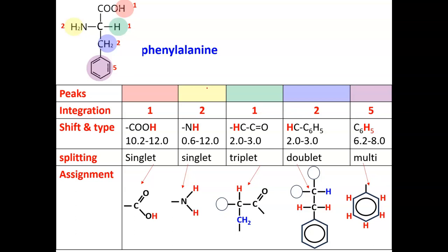The final part of an NMR proton analysis is often the most tricky bit. This is taking the pieces that we've identified and putting the jigsaw back together. Well, we know we've got an arene ring with 5 H's on it, which is therefore monosubstituted. We know we've got 2 H's on a carbon group coming off the ring, because that is our blue peak.